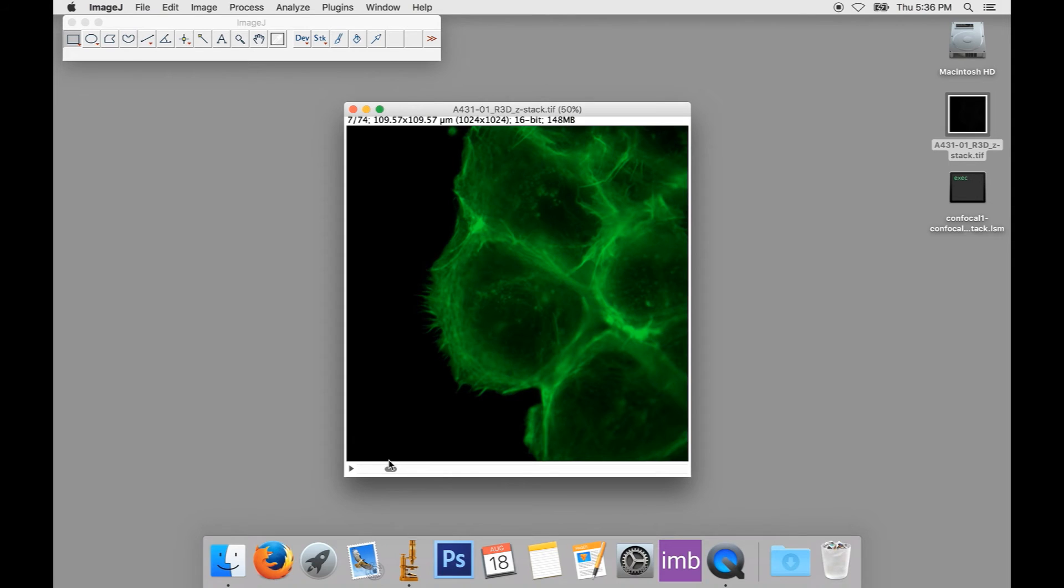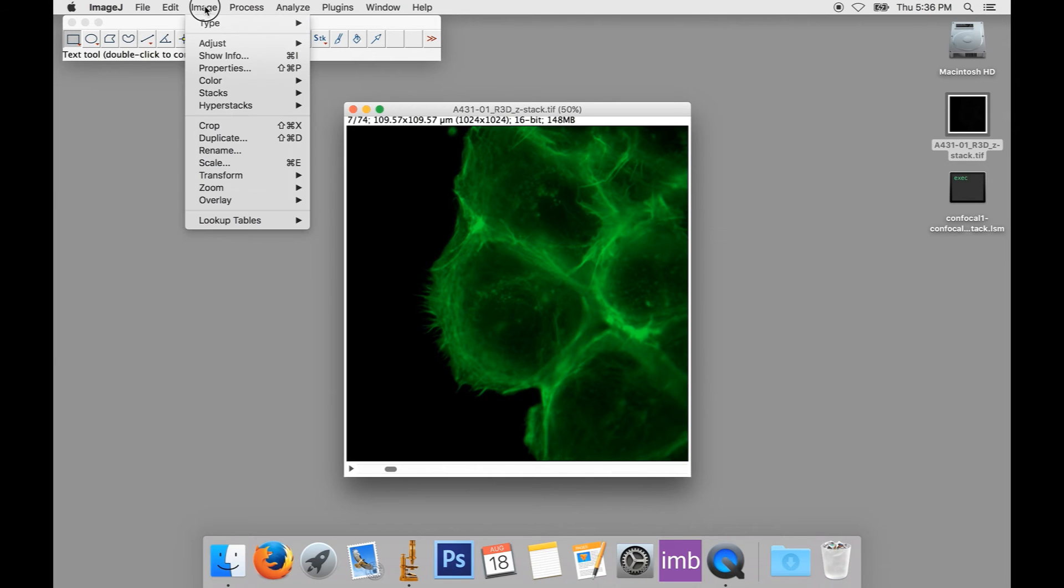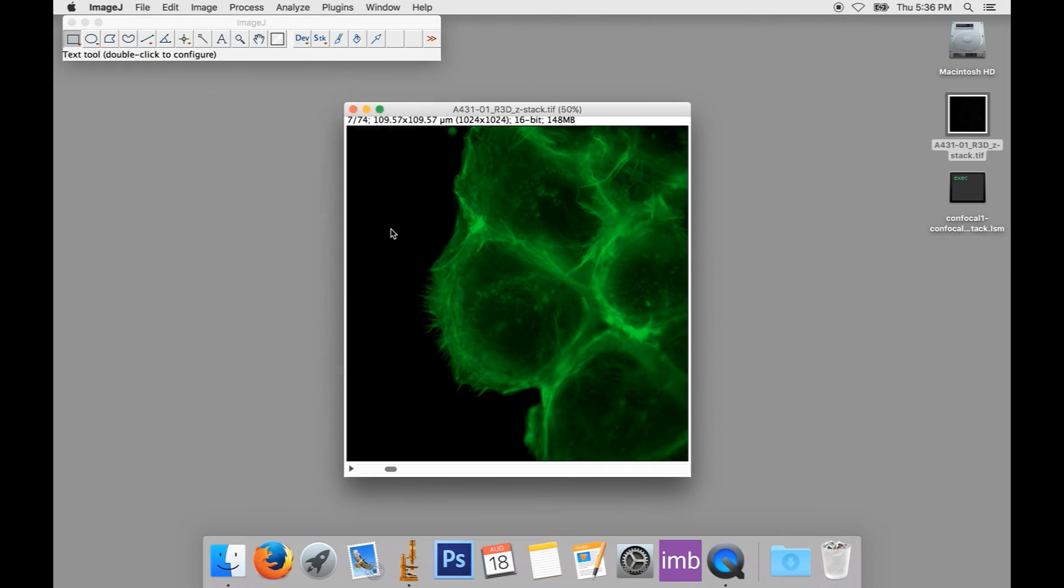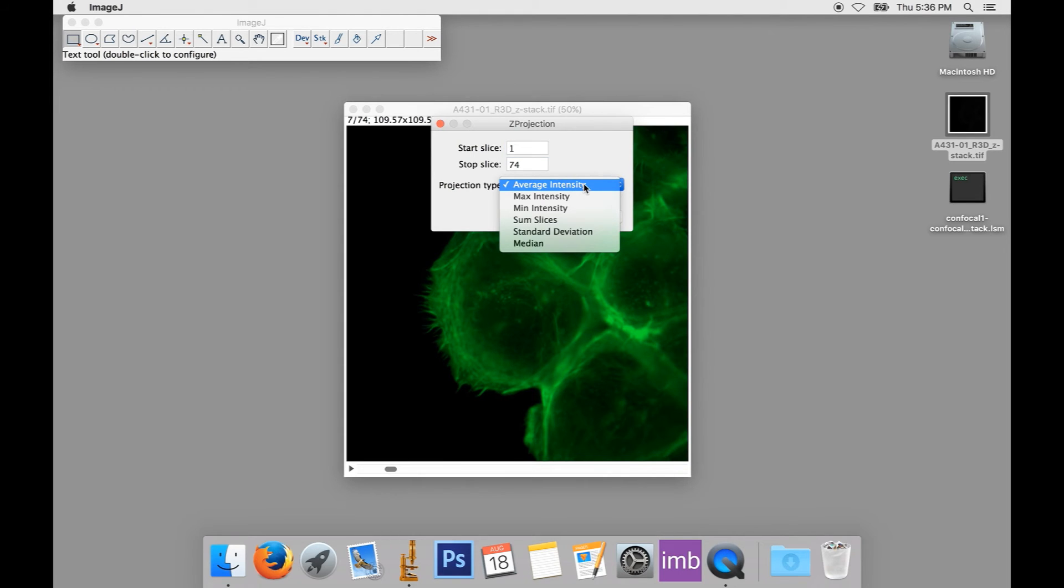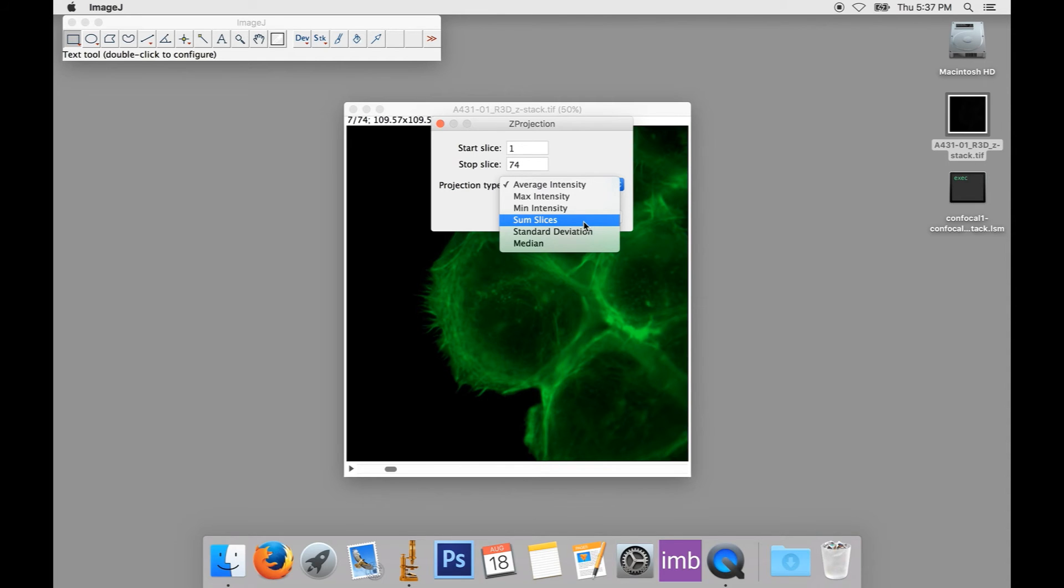But what if we want to show information about all of the planes of focus at once? In that case, we'll want to make a Z projection. To do this, from the menu, we'll select Image, Stacks, and Z Project, which brings up our Z projection dialog box. We can select a number of different types of projections. But the ones we're after for fluorescence images are either maximum intensity or sum slices. Both of these will flatten our Z stack so we can see the whole thing at once. But they work in different ways and produce somewhat different results. Neither one is more correct or better than the other, and each one will show certain features better than the other. Try them both out and see which works for you.